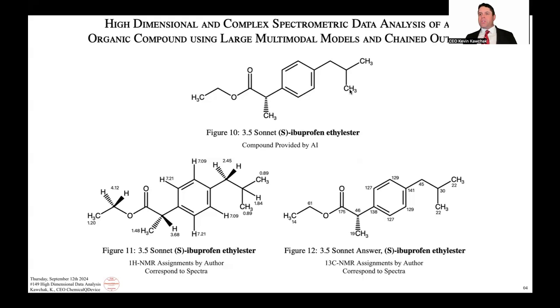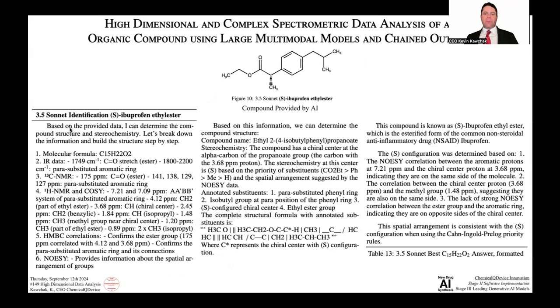So that's very typical. And again, with the diastereotopic protons over here, and then the NOESY, which is the spatial arrangement, again, there are multiple ways to solve it, either using AI or doing it on your own. But it makes sense after doing all the spectra basically manually.